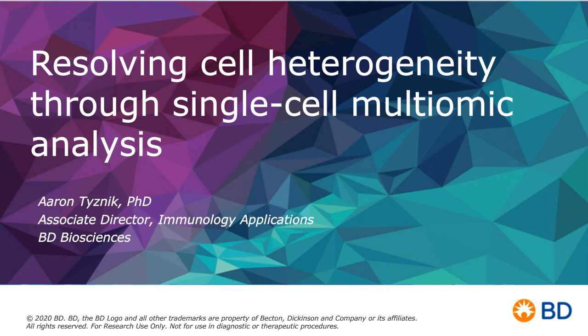Go ahead, Anne. Another question that had been coming up was about cell recovery when we're using the platform. And of course, this may be sample dependent, but go ahead. Sure. Obviously, there are a number of factors that can determine the ultimate capture rate, if you will, but there are a couple of statistics I typically use in terms of capturing cells in the microwells.